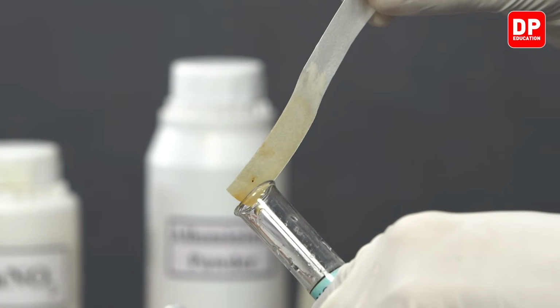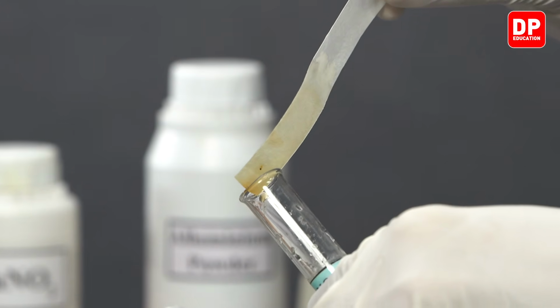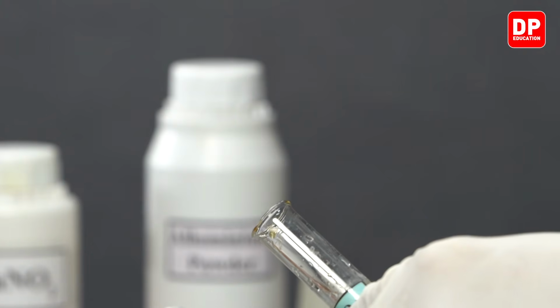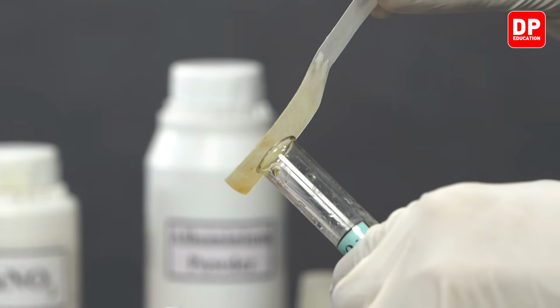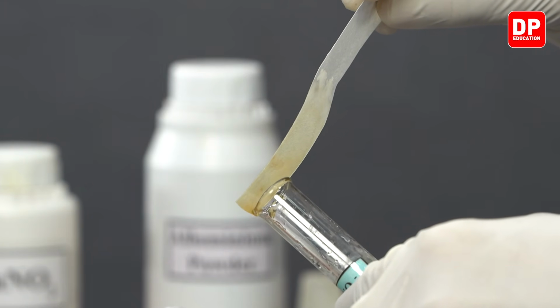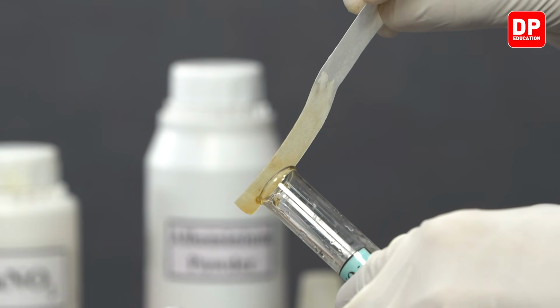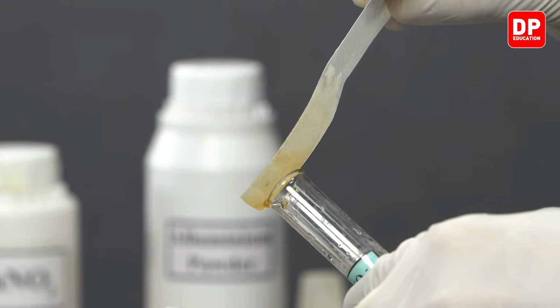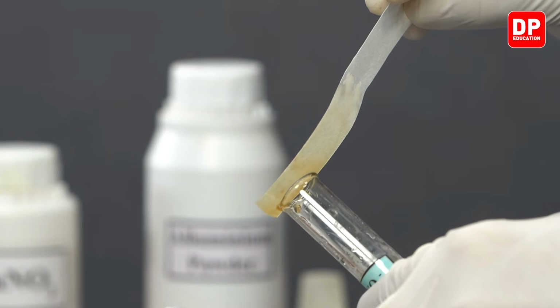Now you can see, students, as ammonia gas is produced, the piece of paper that is soaked in Nessler's reagent is changing its color to a brown color. As you know, Nessler's reagent is used to identify the presence of ammonia or ammonium ions in an aqueous medium.